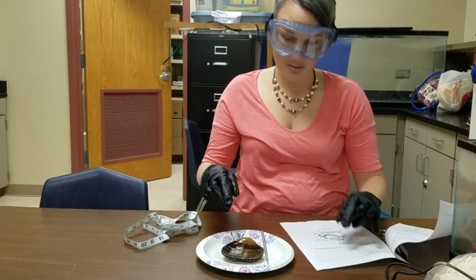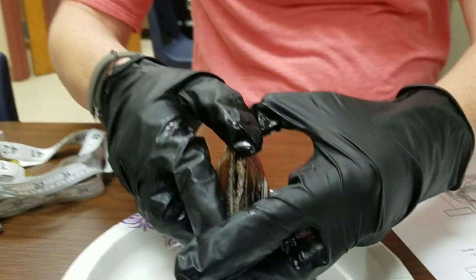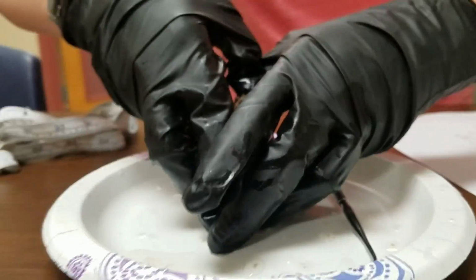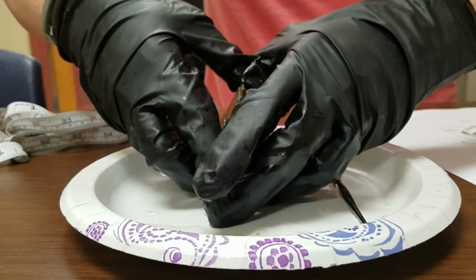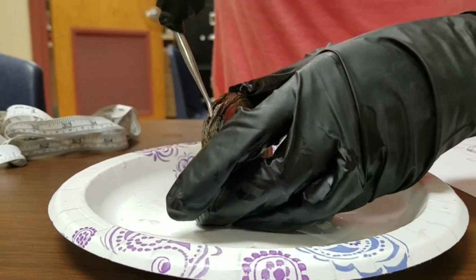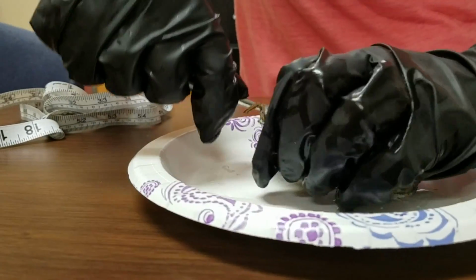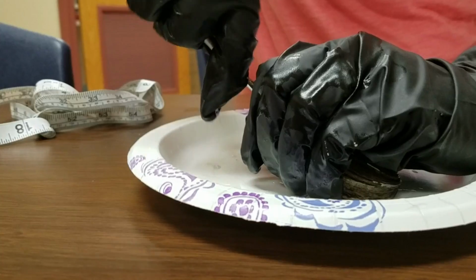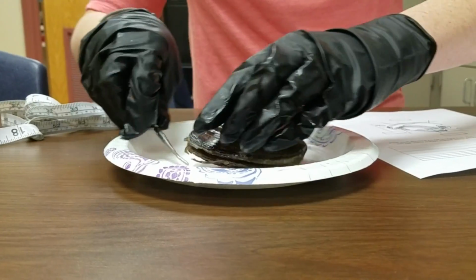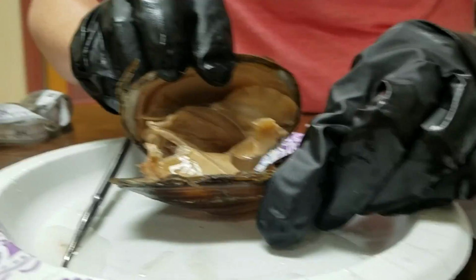Then we are going to move on to the internal. So when you're doing the internal anatomy, most of these have already been pried open, but even though they've been sort of opened and they're not totally closed, it doesn't mean that it's not a heck of a lot of fun to try to get these stupid things the rest of the way open. Feel free to use your probe, use some leverage here. Think back to your physics classes. And it'll pop open at some point. It'll finally give up, and then you can kind of tear it open.